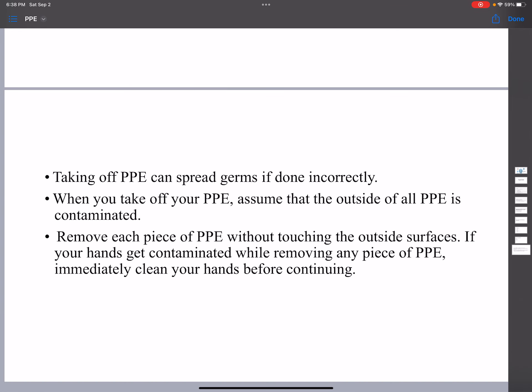Taking off PPE can spread germs if done incorrectly. When removing PPE, assume that the outside of all PPE is contaminated. Remove each piece without touching the outside surface. If your hands get contaminated while removing any piece of PPE, immediately clean your hands before continuing to take off PPE.